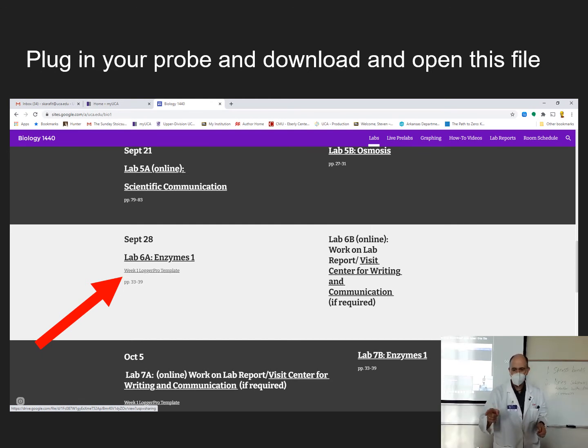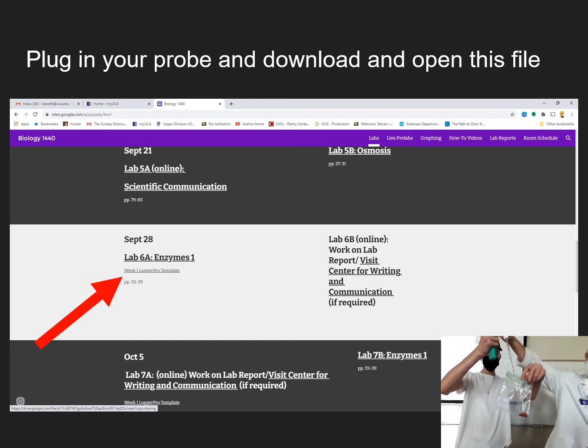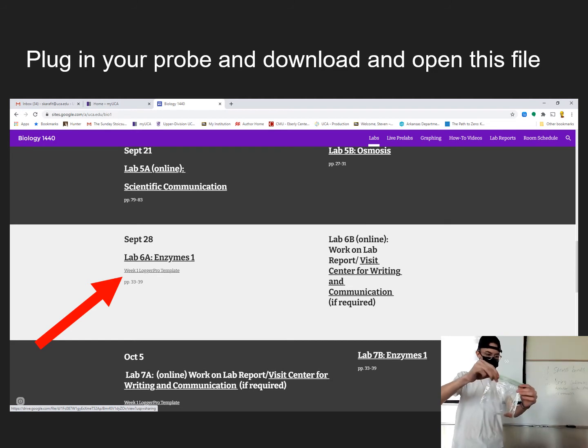For those of you watching at home, we're about to squirt peroxide into a baggie with chicken liver in it. We're going to watch the reaction. Go, you ready? There you go. Now seal the bag up. Now see if you feel it. Feel the bag where the reaction's going, and see if you notice anything qualitative. We're looking for qualitative observation.